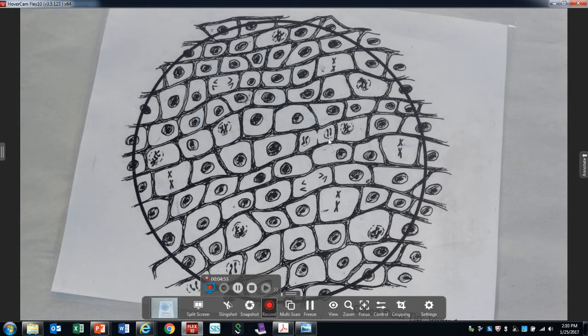Telophase. One way to know, look at the size of this cell. See that? The cell next to it is like a parent cell. It's going to go through division soon. That's interphase, but it's half the cytoplasm. After cytokinesis, the cell has half the cytoplasm. It's got 100% of the genetic material because it's a clone. So that's one of the ways to look through with this.